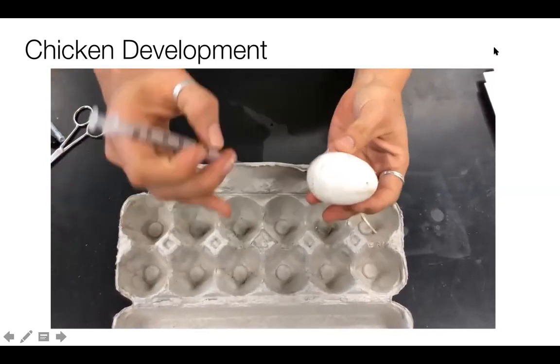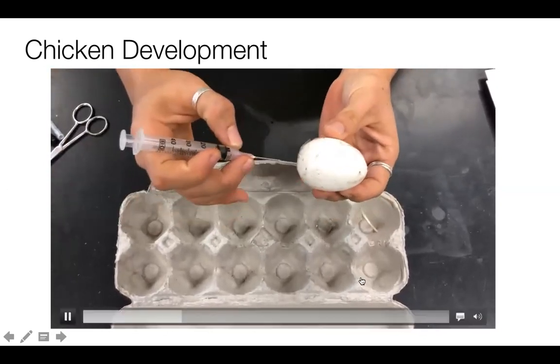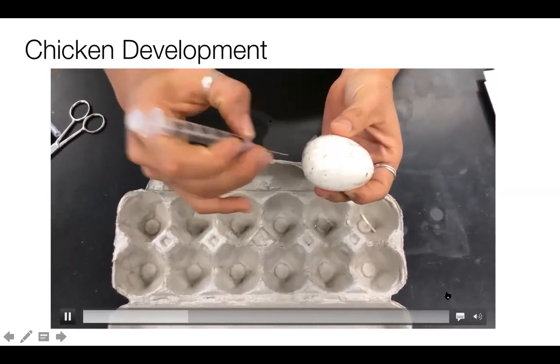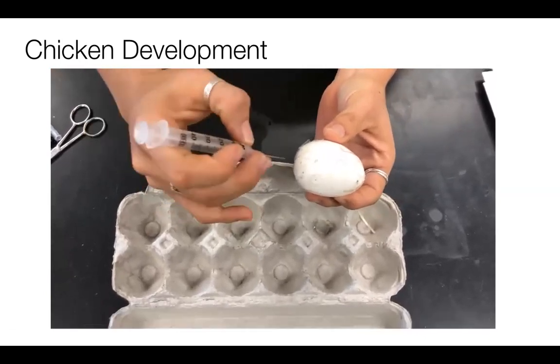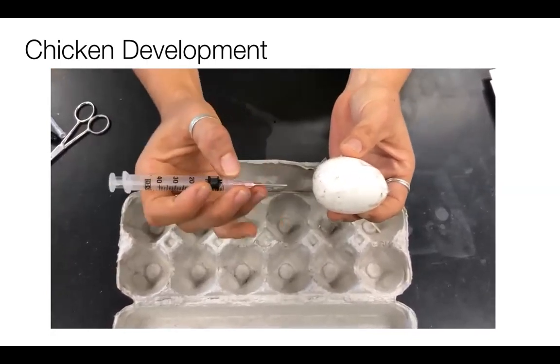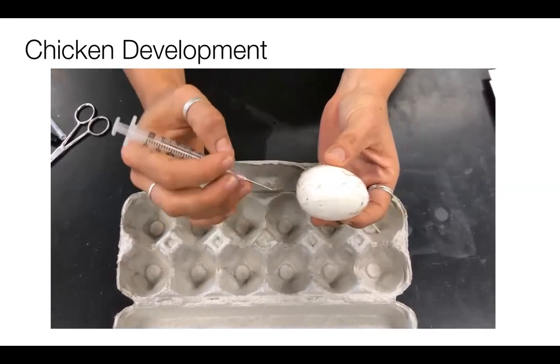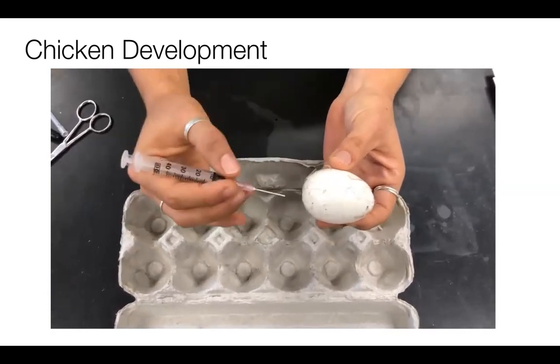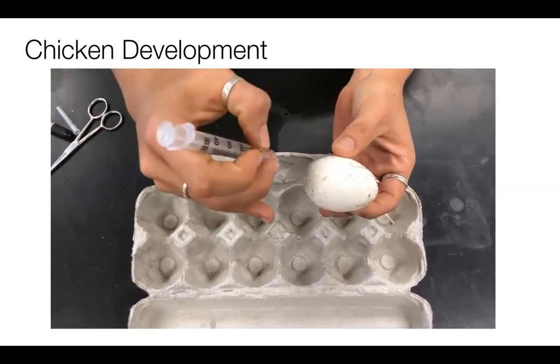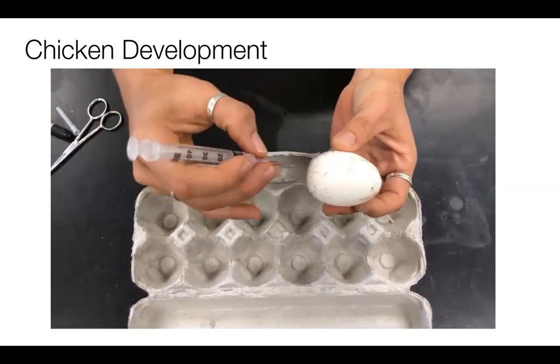When we do this, you want to make sure that your needle is directed at a diagonal angle. If you go horizontally into the egg, you will poke the egg yolk, and then it'll get messy, and you won't be able to see the embryo as well. So just remember, keep your needle diagonal as you're drilling your hole in.